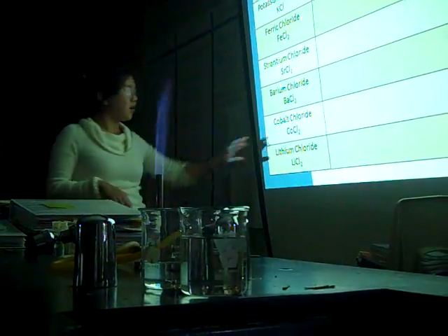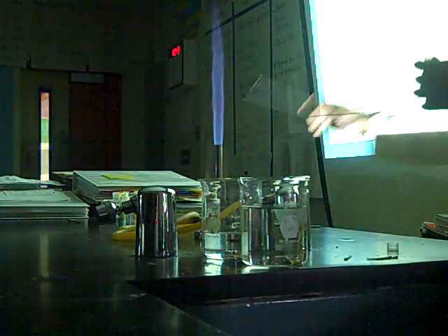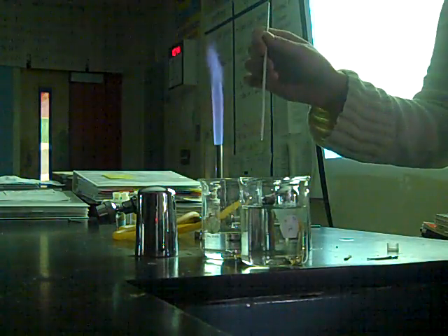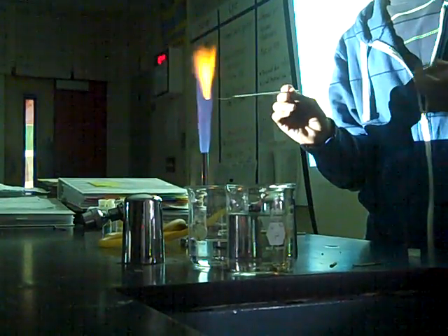All right. So we're on to cobalt chloride. Who wants to do cobalt chloride? Guillermo. Guillermo. Come on up. All right. What do you see about cobalt chloride, Guillermo? What does it look like? Kind of black or purple. Okay. Kind of black, purple. That's what cobalt chloride looks like. All right. All right. Hold that. Right into the flame. Whoa. Okay. Did you guys see that before it changed back to orange?